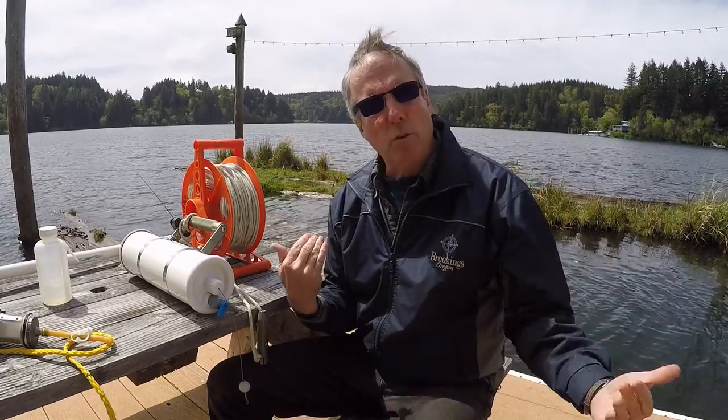So we've talked about sampling for water quality. We talked about the multi-parameter probe being able to do your dissolved oxygen, your temperature, your pH, and your conductivity. But the cord was pretty short. It was only about 5 feet long, so if you wanted to have anything deeper than that, you had an issue trying to get that sample.